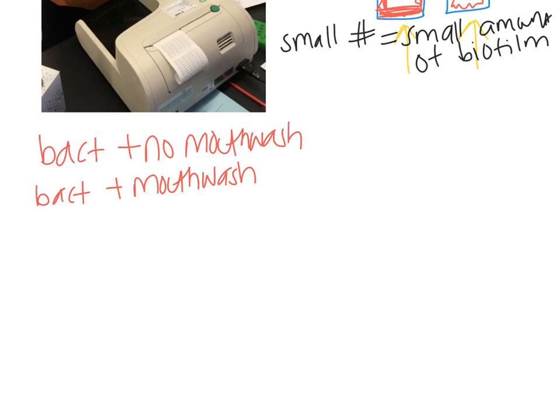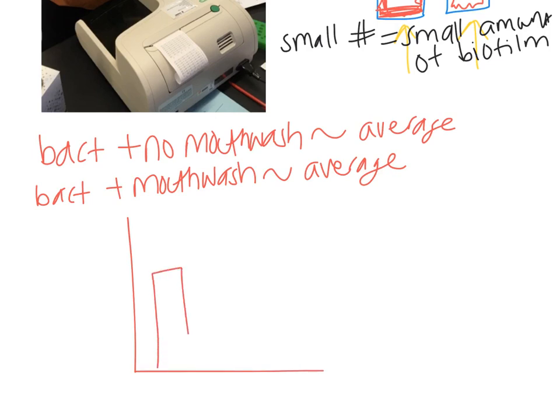When you look at all of the 12 wells of data, you are going to average them. So you will find an average for each of these. Your bar graph will then contain only the 2 averages, meaning your bar graph should contain only 2 bars. There will be 1 bar for bacteria with no mouthwash and 1 for bacteria with mouthwash. What you are graphing, what those numbers are, is average absorbance.